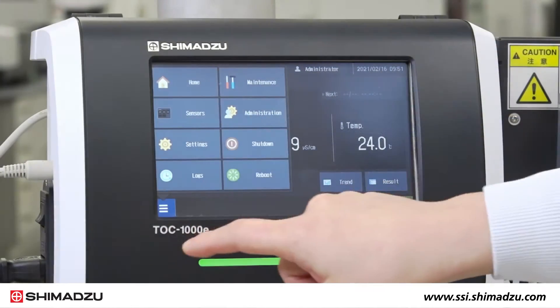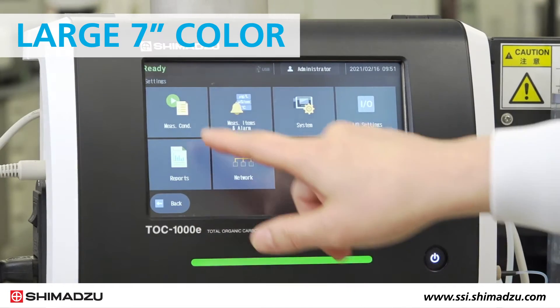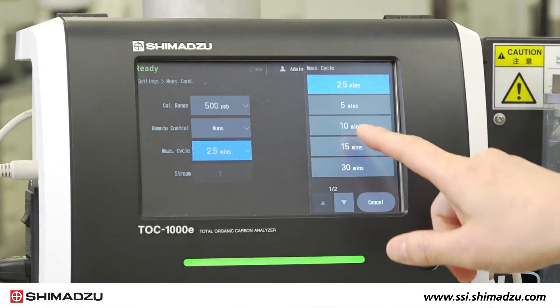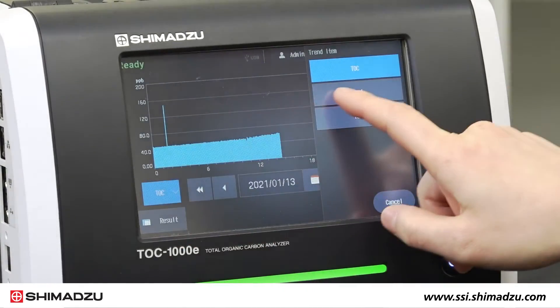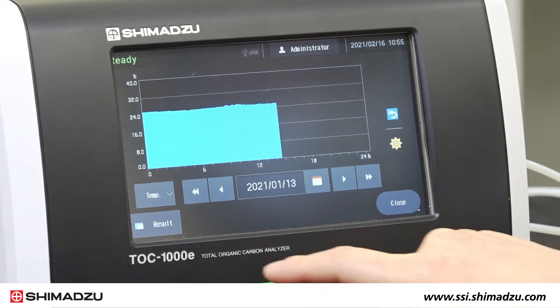The TOC1000E features a smart user interface and large 7-inch color touchscreen display to provide exceptional visibility and usability. The indicator clearly shows analyzer status, so you can act quickly to resolve any issues.